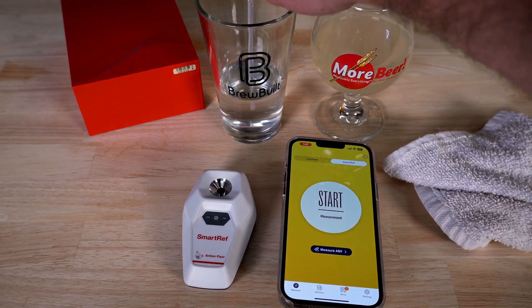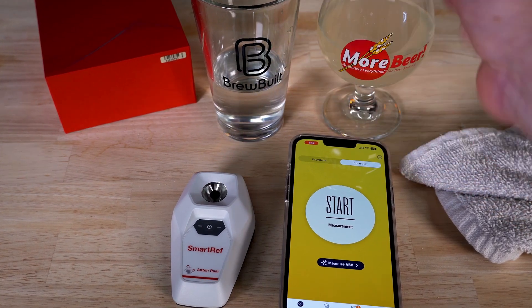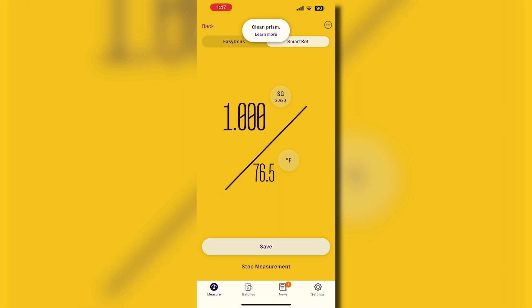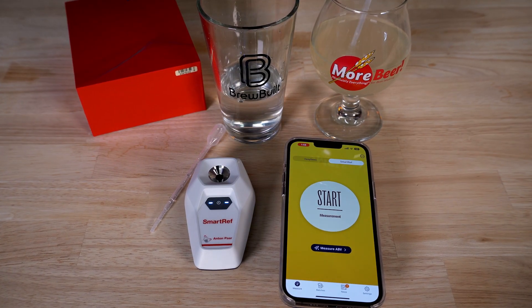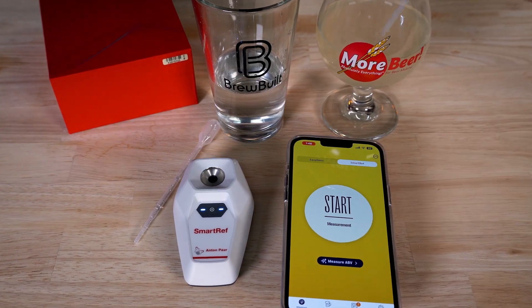Let's go ahead and take a measurement. First thing we're going to want to do is add a little distilled water and make sure it's reading zero. After you've taken off the water and dried the lens, you're ready to add whatever you're going to measure. In this case we're using wort, so we're going to add a little bit in there, hit start measure, and it's ready to take your measurement. It's that easy.